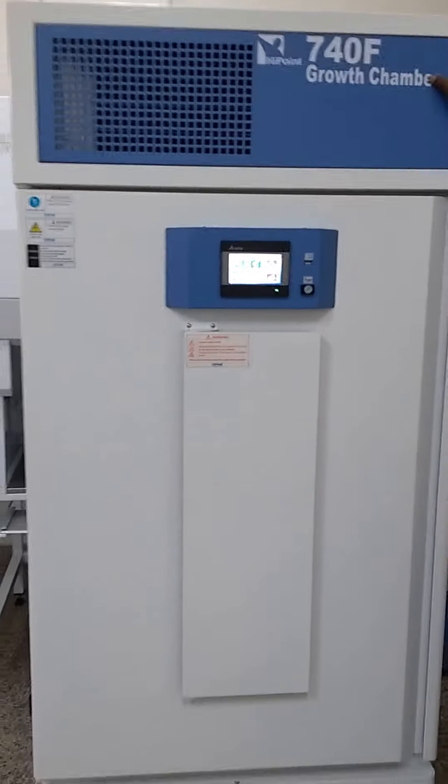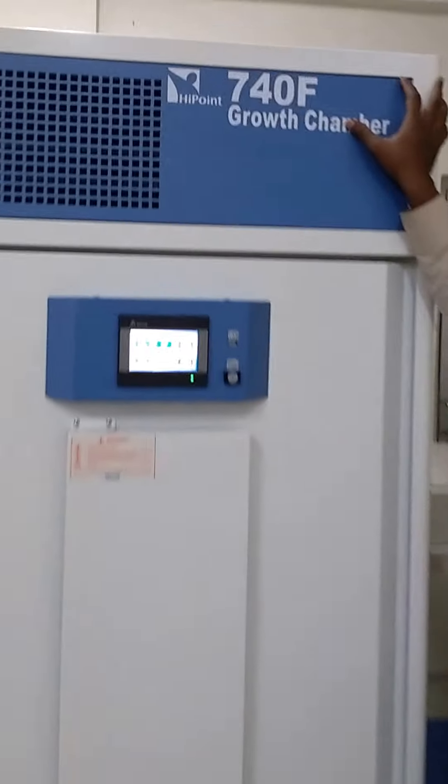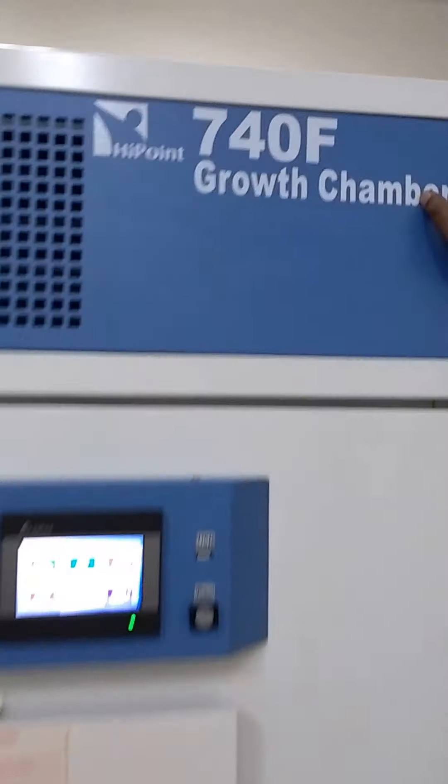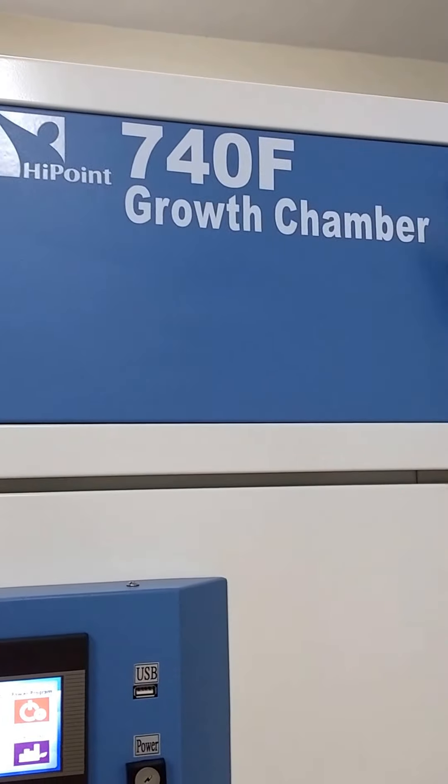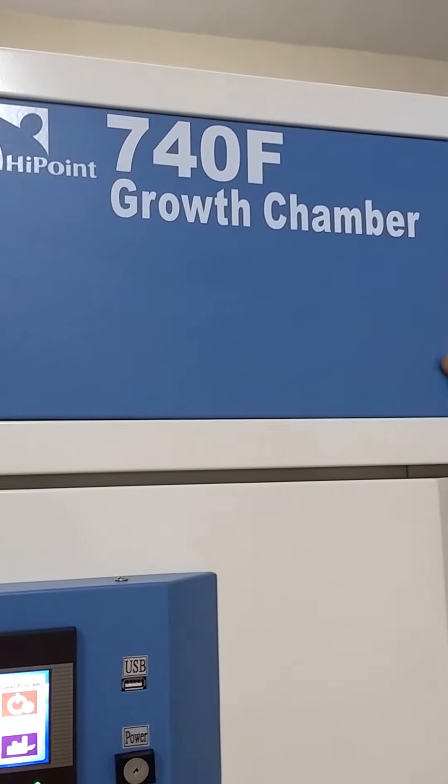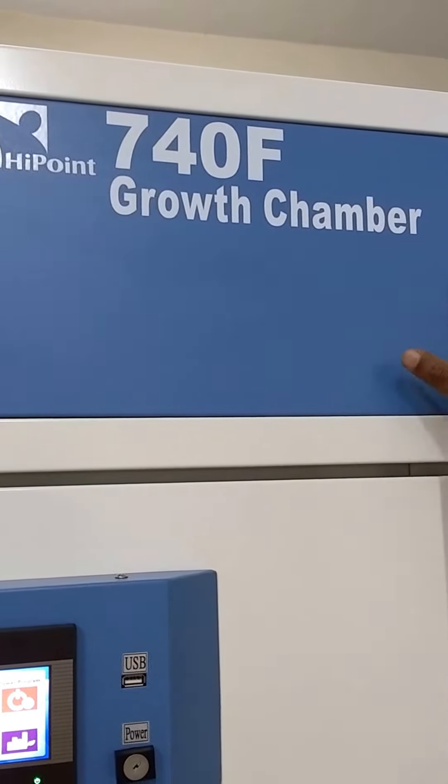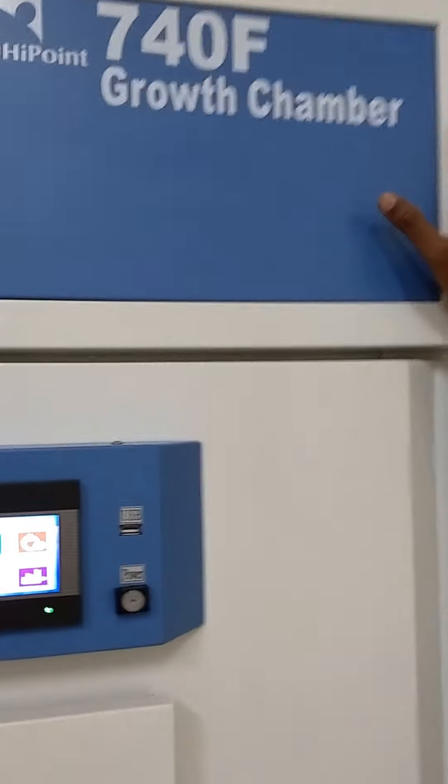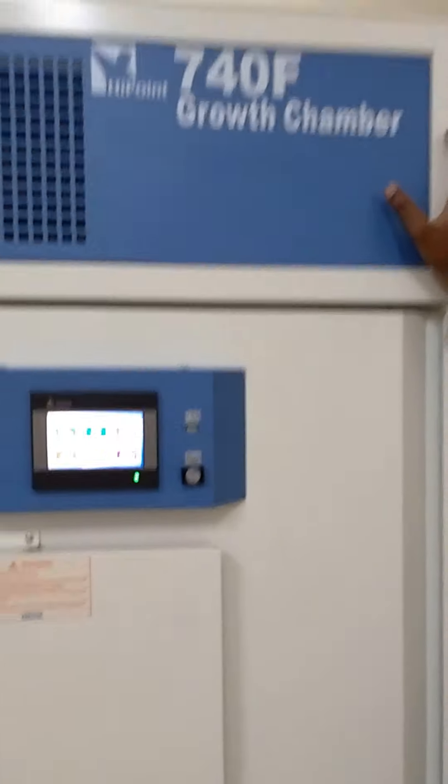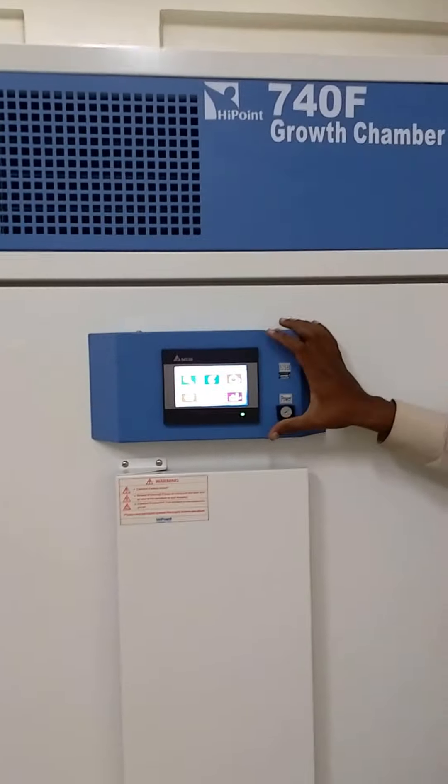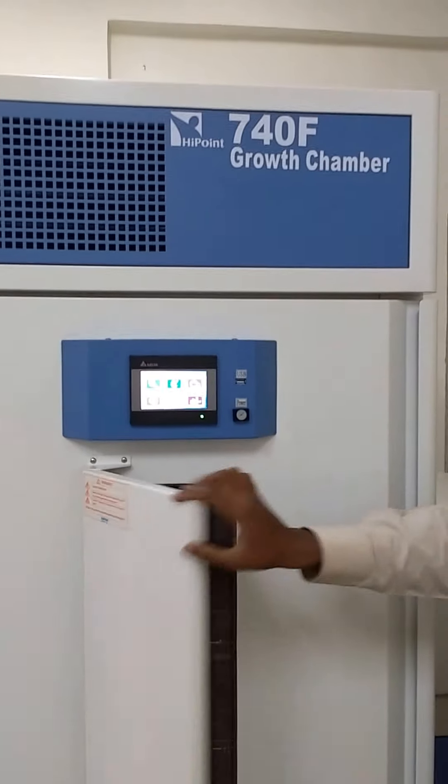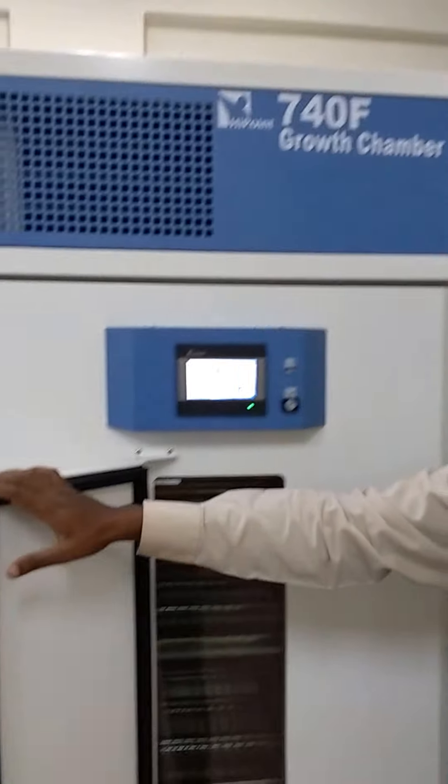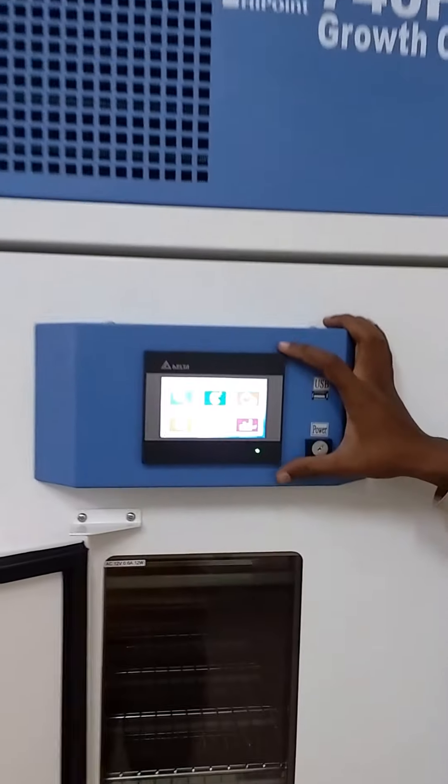This is our Genaxy HiPoint 740F growth chamber or cold incubator or BOD incubator. It has a temperature range of 0 to 60 degrees. It has a main viewing window and a 4.3 inch HMI display.